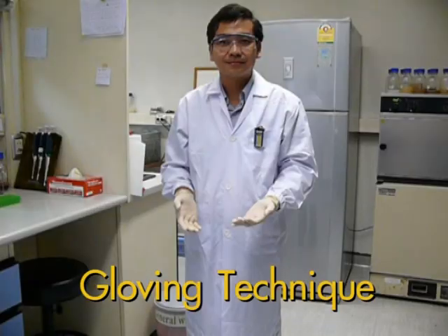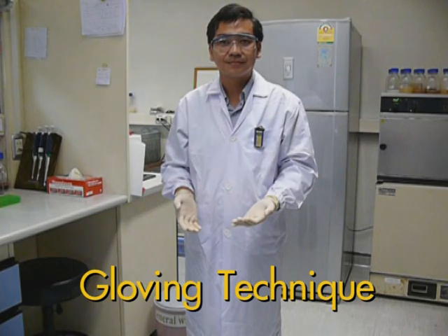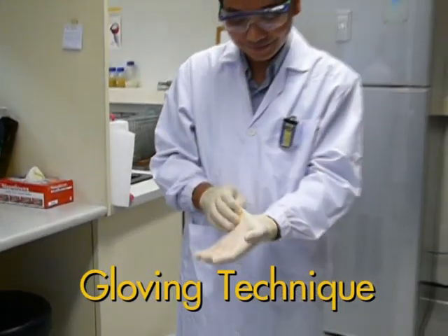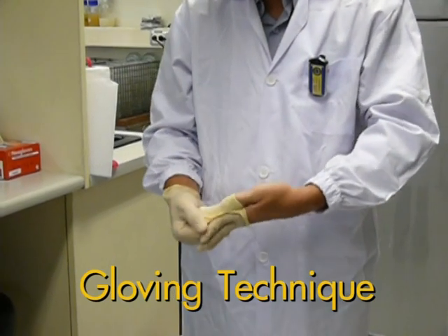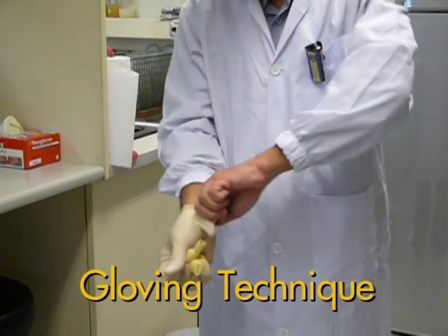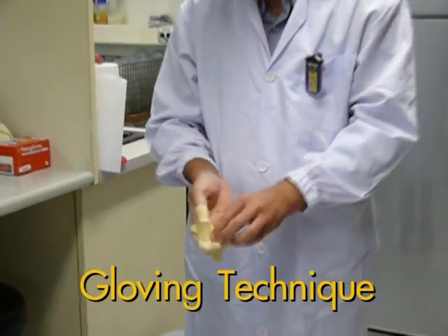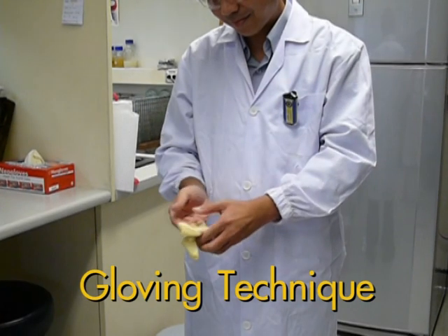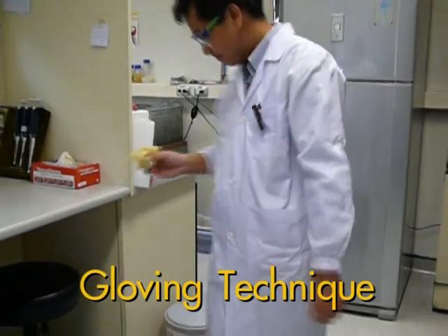Gloving technique. When you remove your gloves, your intent is to avoid touching the contaminated surface of the gloves with your bare hands. When taking off your gloves, firmly grip one glove at the base of the palm and pull it off inside out. Holding the balled-up glove in the palm of your other gloved hand, slip your bare fingers under the wrist of the remaining glove without touching its outer surface. Push the glove down and off with the first glove inside of it. One glove is now inside the other, and both are inside out. Properly dispose of the used rubber gloves.